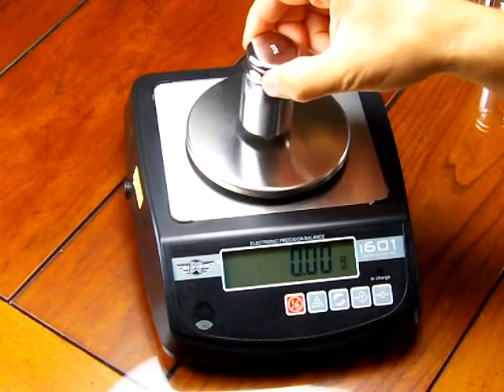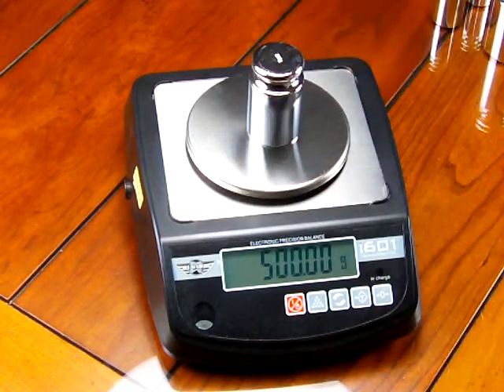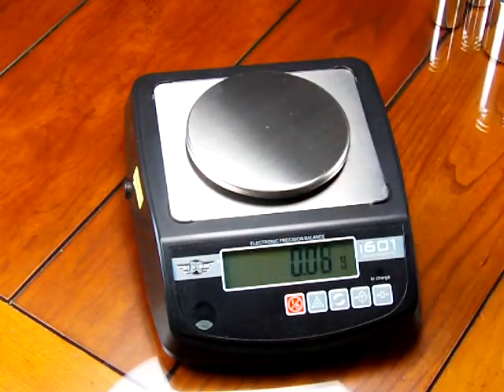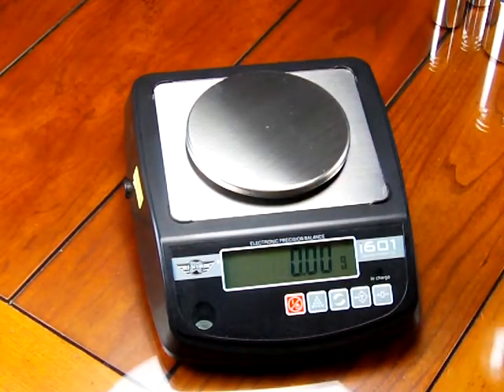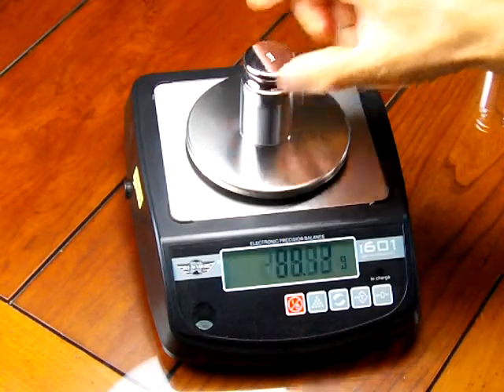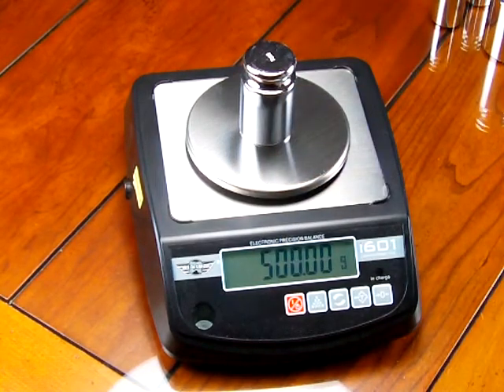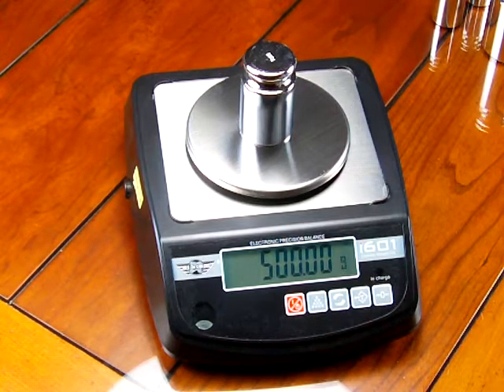So if I put the calibration weight on, you can see now, not only is the scale very precise or repeatable, it is also now very accurate. So the 500 reads 500 grams.